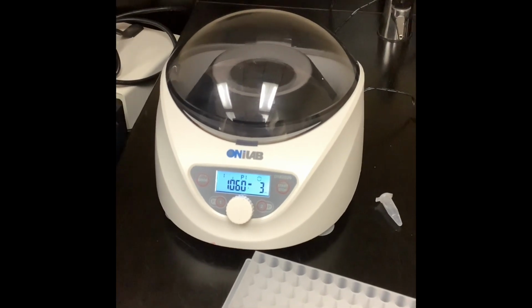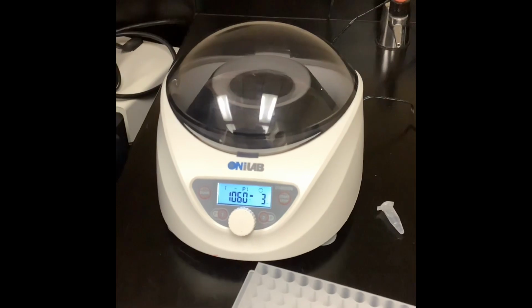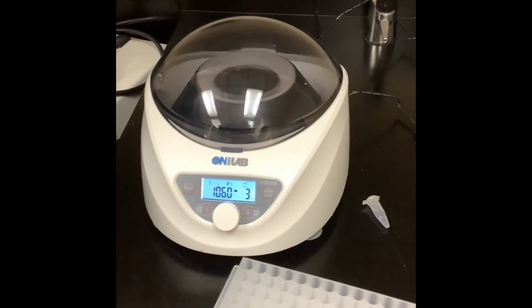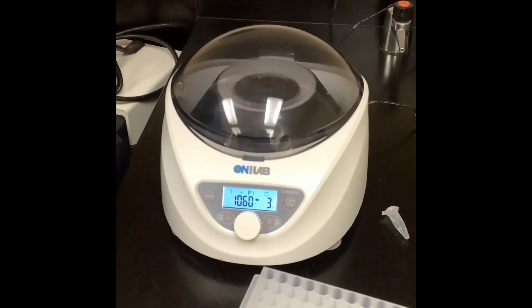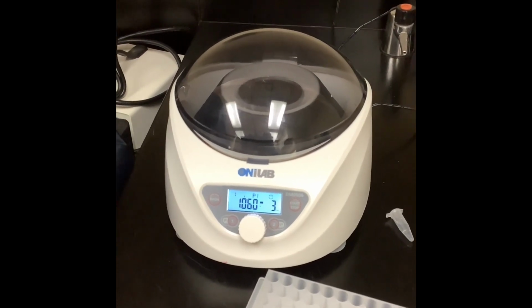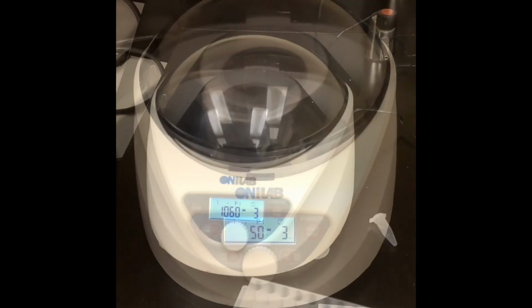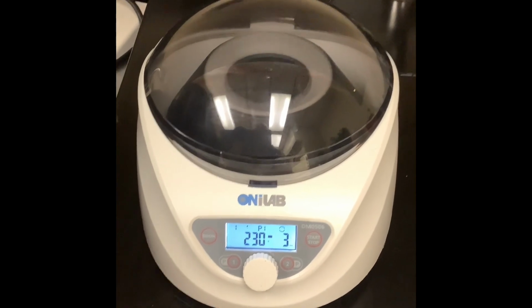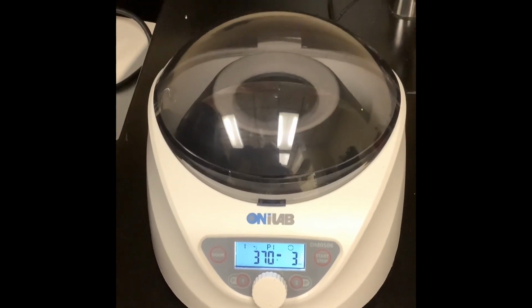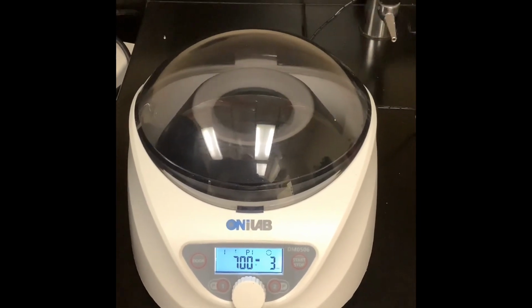After this, I'm going to once again remove all of the liquid from the tube, being careful not to disturb the pollen sample. And then I'm going to be adding water to each tube. I usually try to shoot for like 75% of the tube being full of water at that step. The samples now have water in them, so I'm centrifuging once again at 1060 G. After they're centrifuged, I'm going to remove the liquid carefully one last time, and then we'll move on to staining the pollen.